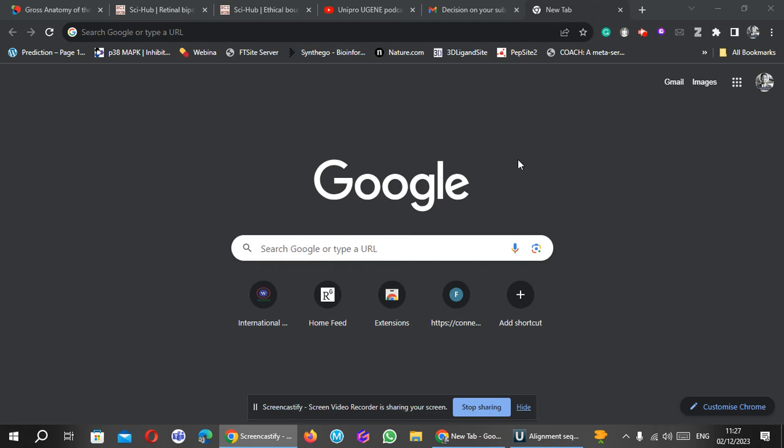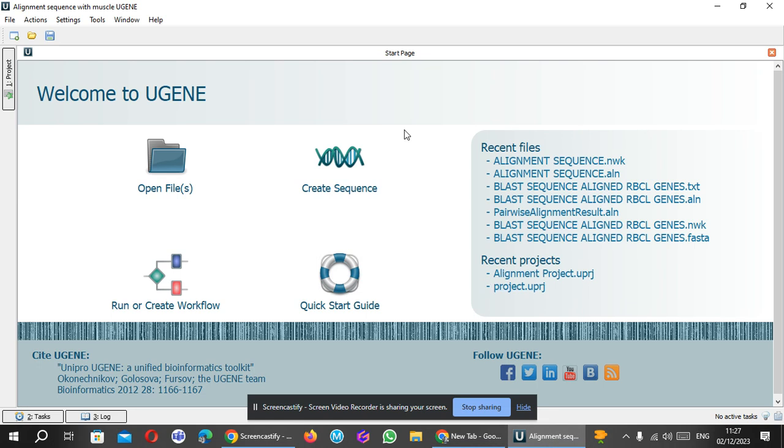So, for the video, this is just the illustration of how I went about the RBCL sequence you sent, using the Unipro UGENE software. So this is the software, UGENE.